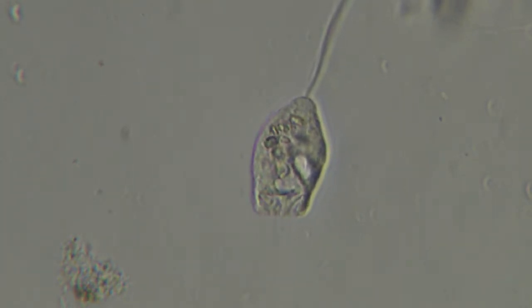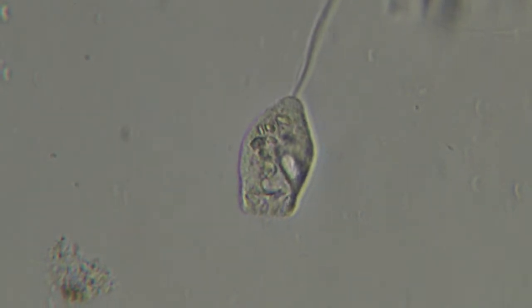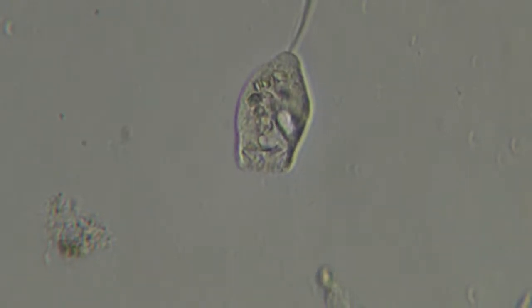Very cool. I love Vorticella. You often get them in a little colony, like four or five or more in a little cluster, just attached to debris like this, just hanging out there.